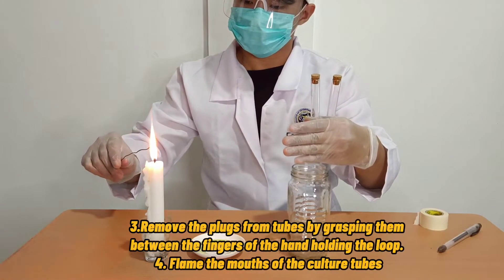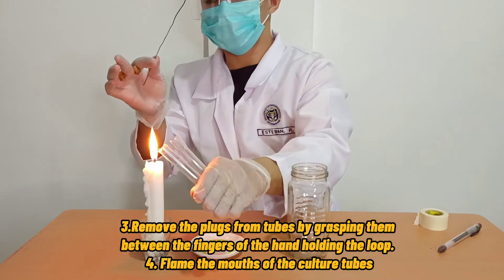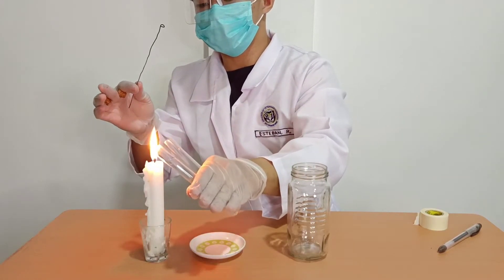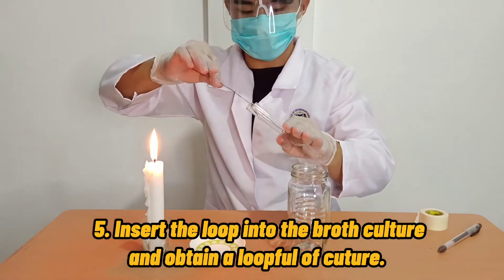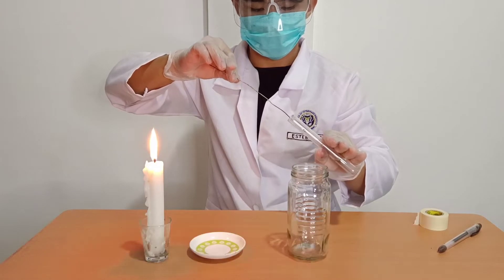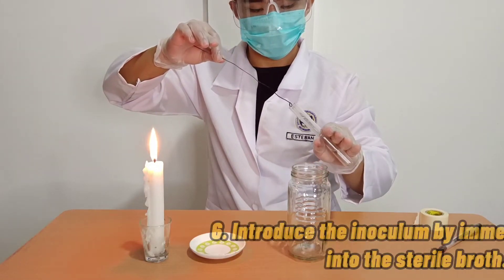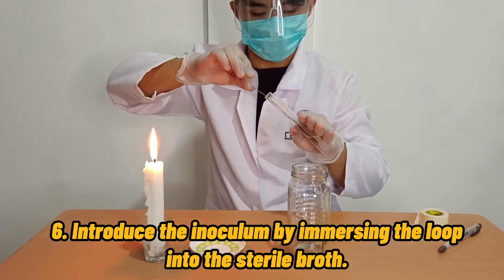Third, remove the cotton or rubber plugs from the tubes. And fourth, flame the mouths of the culture tubes. Fifth, insert the loop into the broth culture and obtain a loop full of culture. Sixth, introduce the inoculum by immersing the loop into the sterile broth.